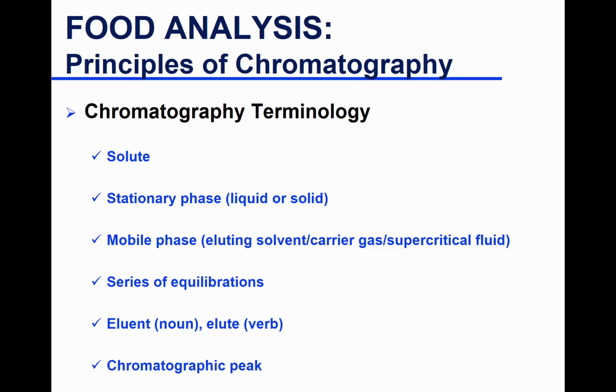So you start with your nonpolar components and you put water as your mobile phase. Why do you do that? Because number one, you want your compounds to interact with the column. If they do not interact with the column, there's not going to be a separation. They're going to leave with your mobile phase. So you defy the purpose. So if you have a hydrocarbon group, that means your solvent would be mostly aqueous. Your beginning will be mostly aqueous. So you will have a water solvent.